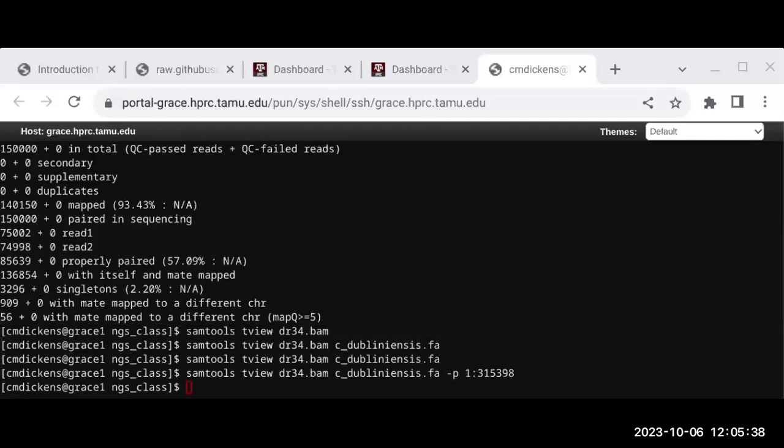So when you run Trinity, it creates a lot of small files as it builds these assemblies for the transcripts. It can create 200,000, 300,000, 500,000 files, depending on the size of your genome. You can work this into the temp directory. An approach is to move everything to the temp directory, do the analysis there, copy the results back. We do have a job script for that, and we have documentation on our website that shows you how to do this.